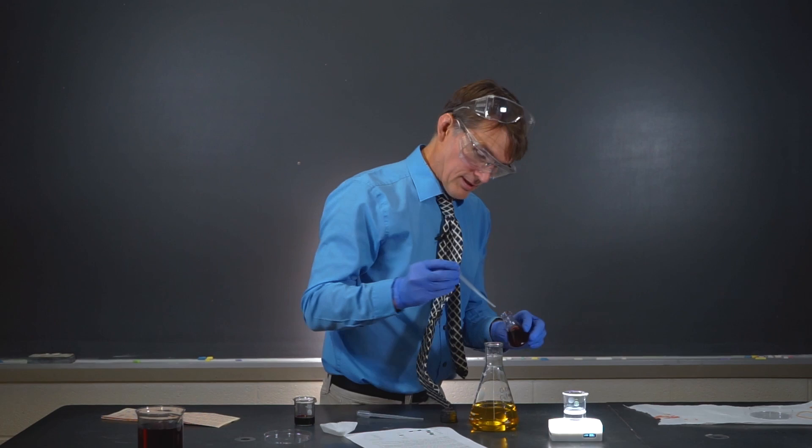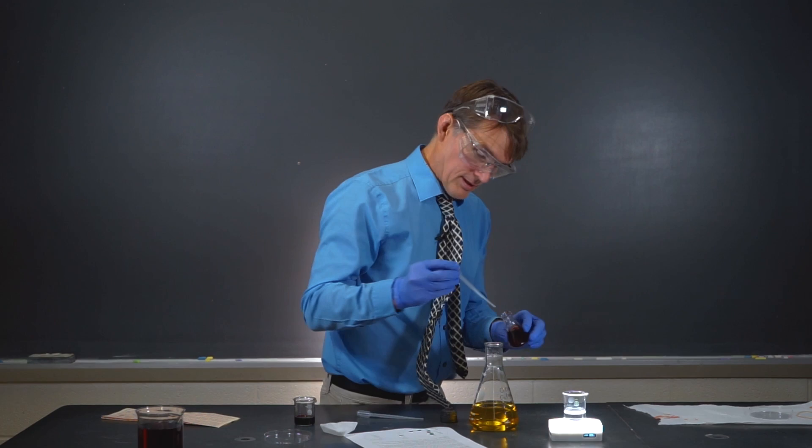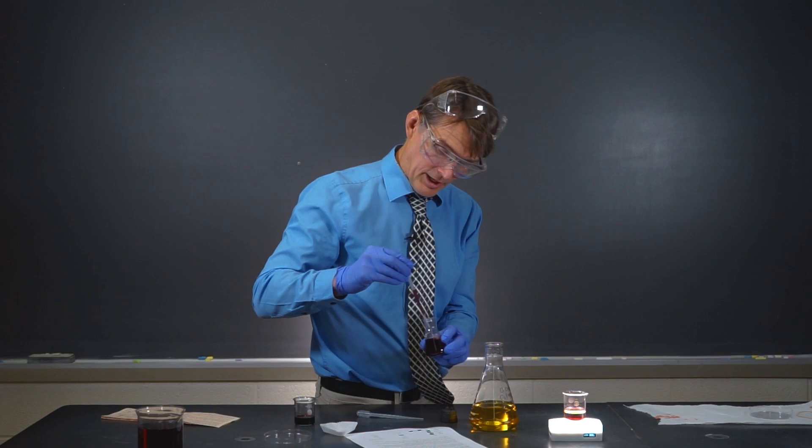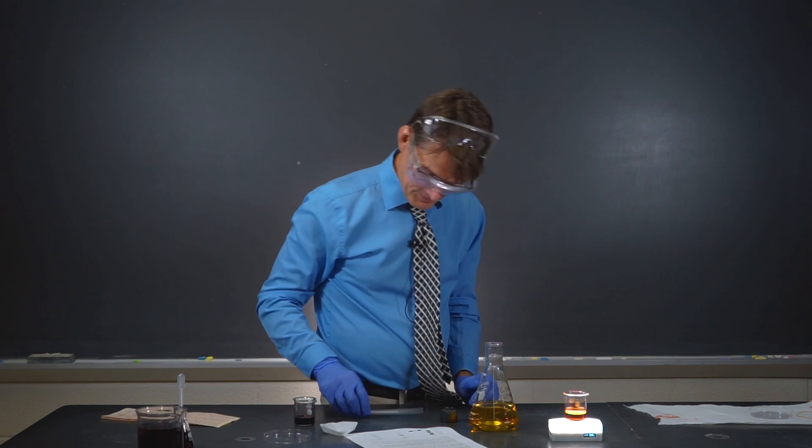Okay, we're going to add a little bit of this iron indicator solution. Remember, it's got iron 2 ions in it. And those are going to look red, of course. Our iron indicator looks red in the presence of iron 2. And let's show you how we can get that blue color by adding some cerium 4 ions, which are yellow.